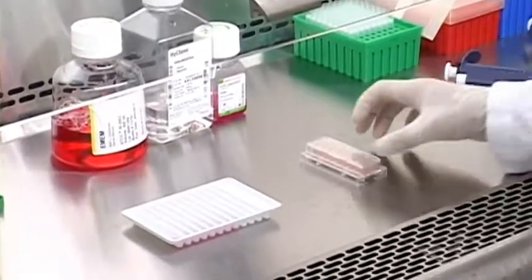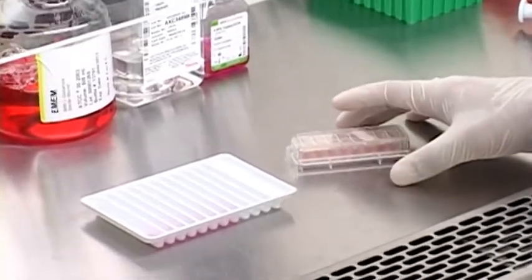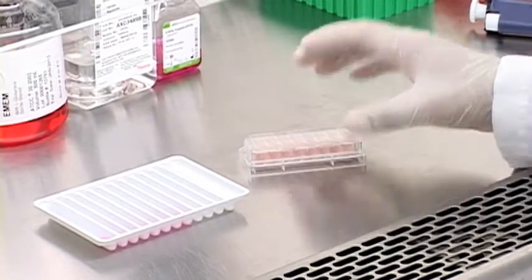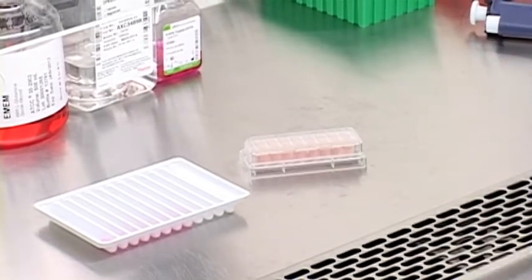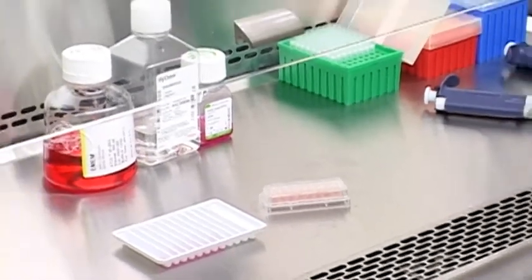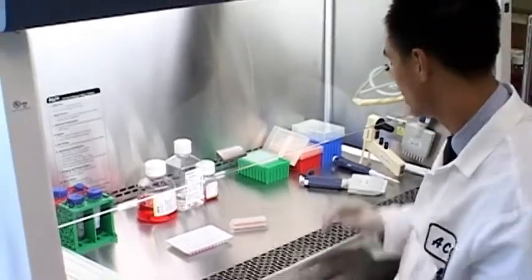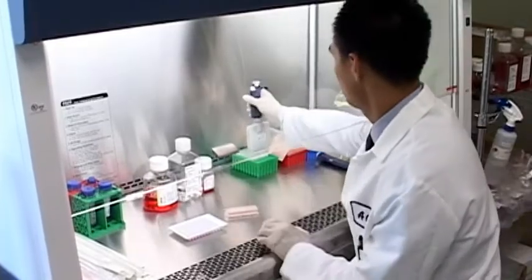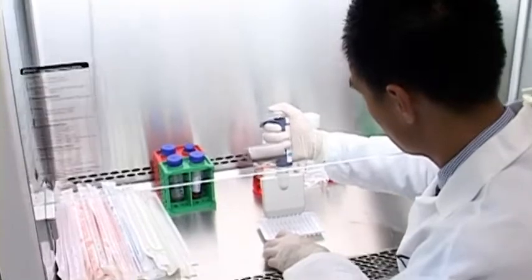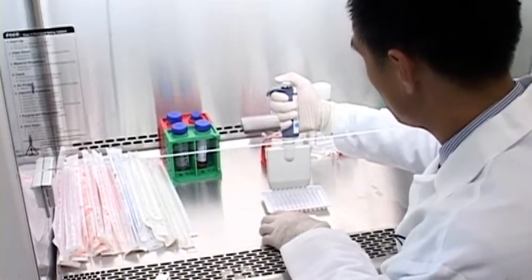Now in general, after adding your compounds, in order to minimize the amount of time underneath the hood and outside from the station, we'll add the compounds and quickly transfer it back to the station and begin monitoring. The idea is if your assay is a very short-term receptor signaling assay, then you want to minimize the amount of time points that you miss after adding your compounds. So, I have my multi-channel, 50 microliters. And after this, I'll quickly return it to the station.